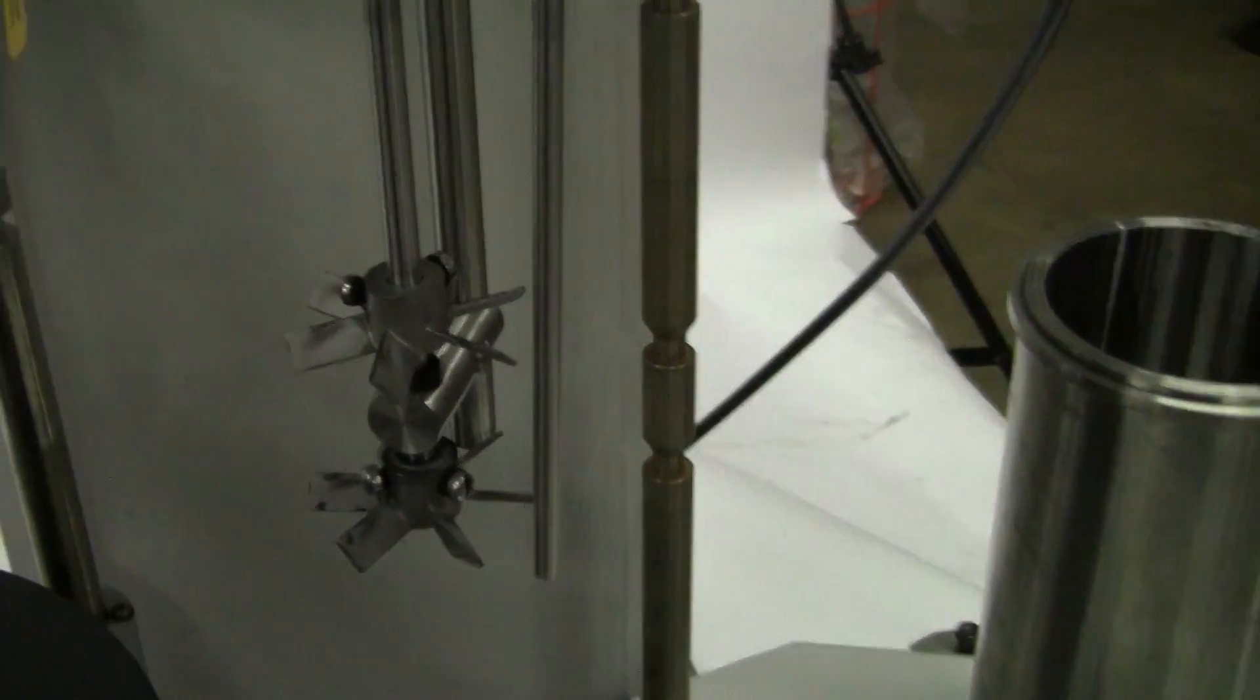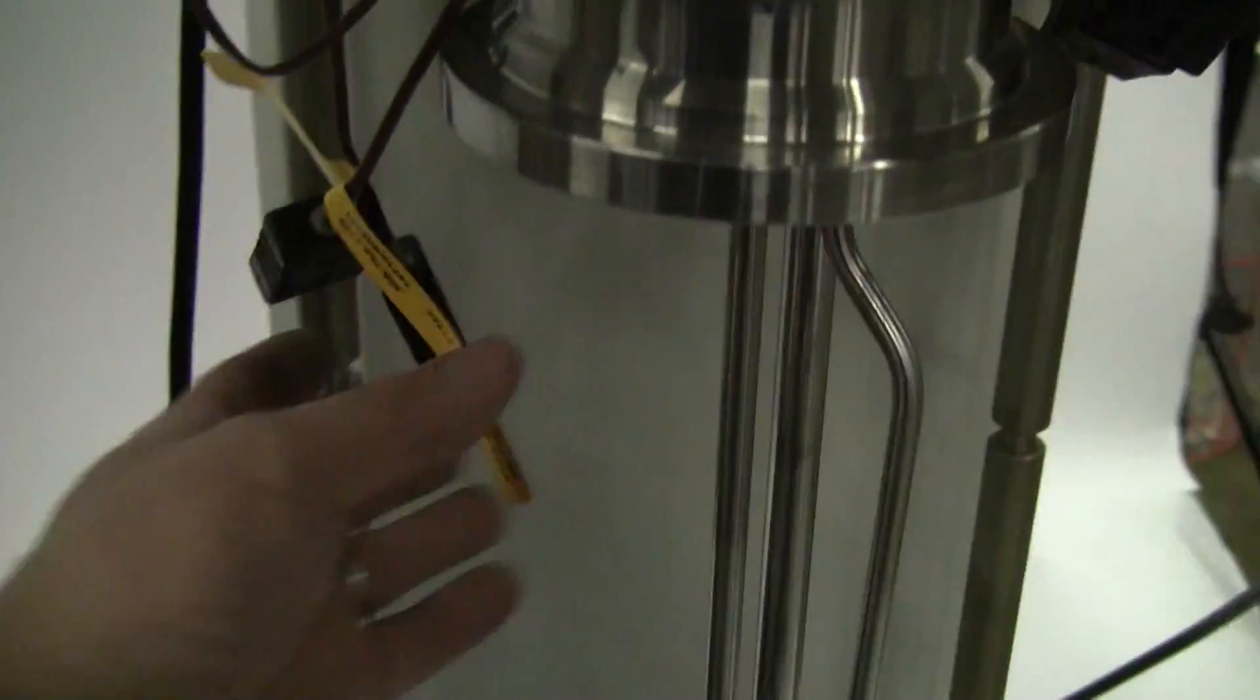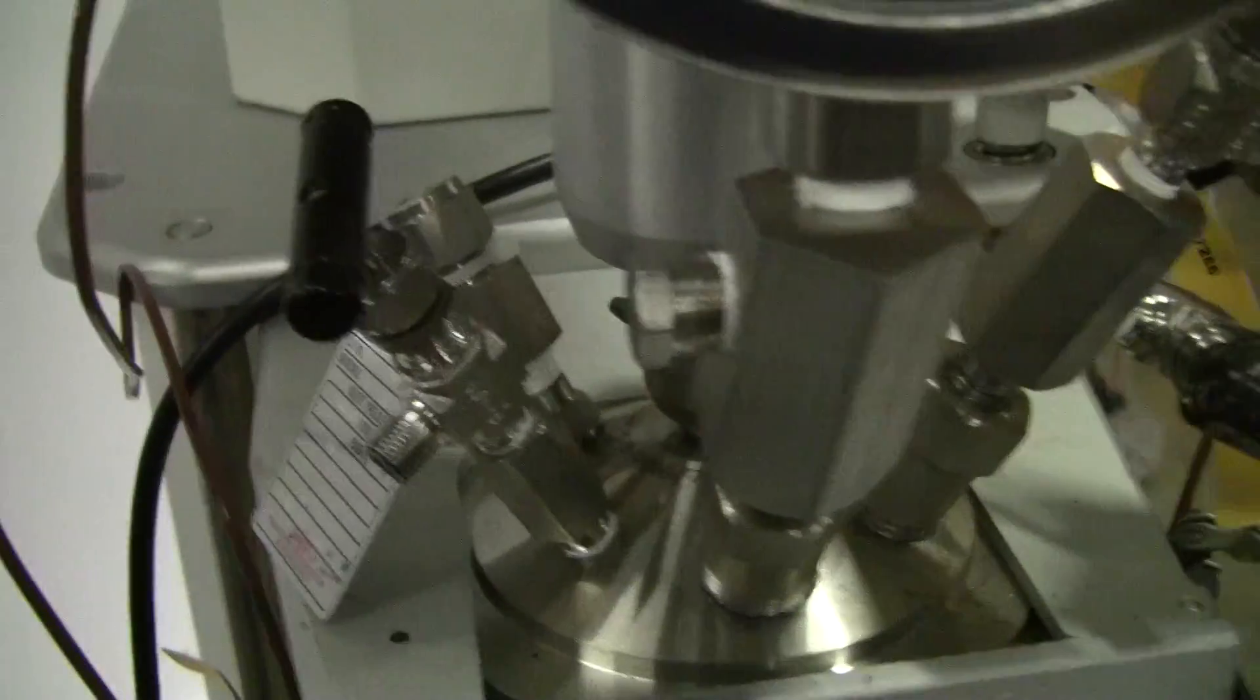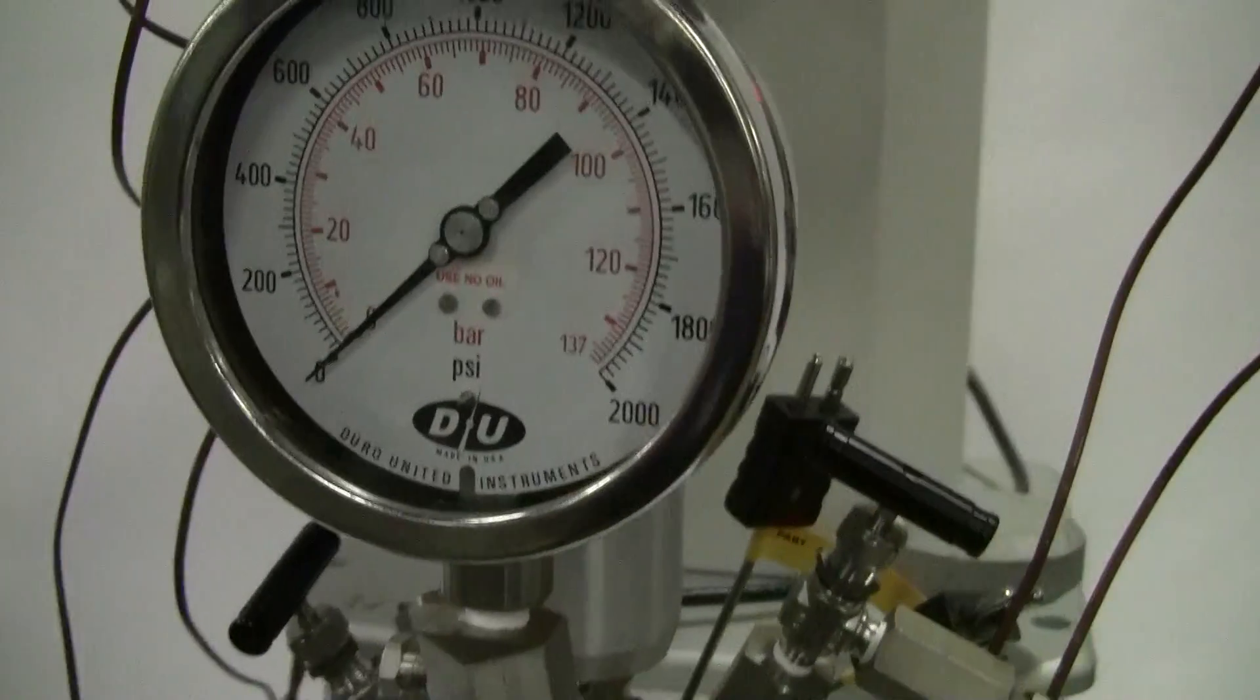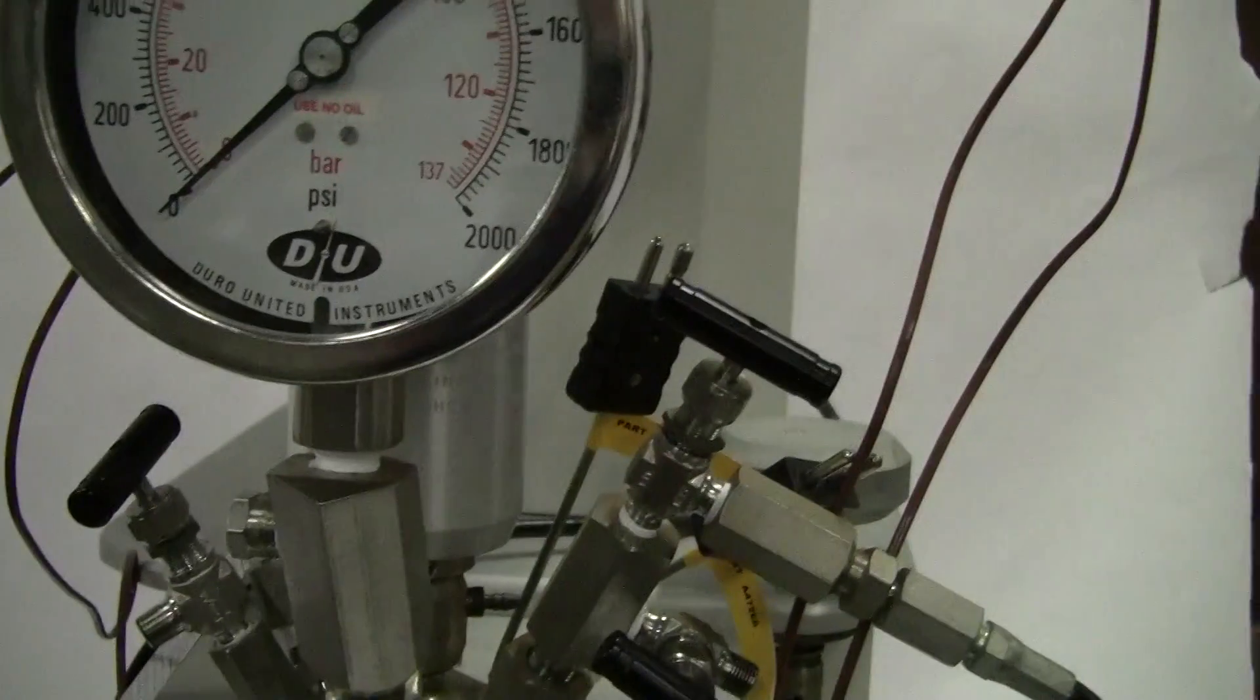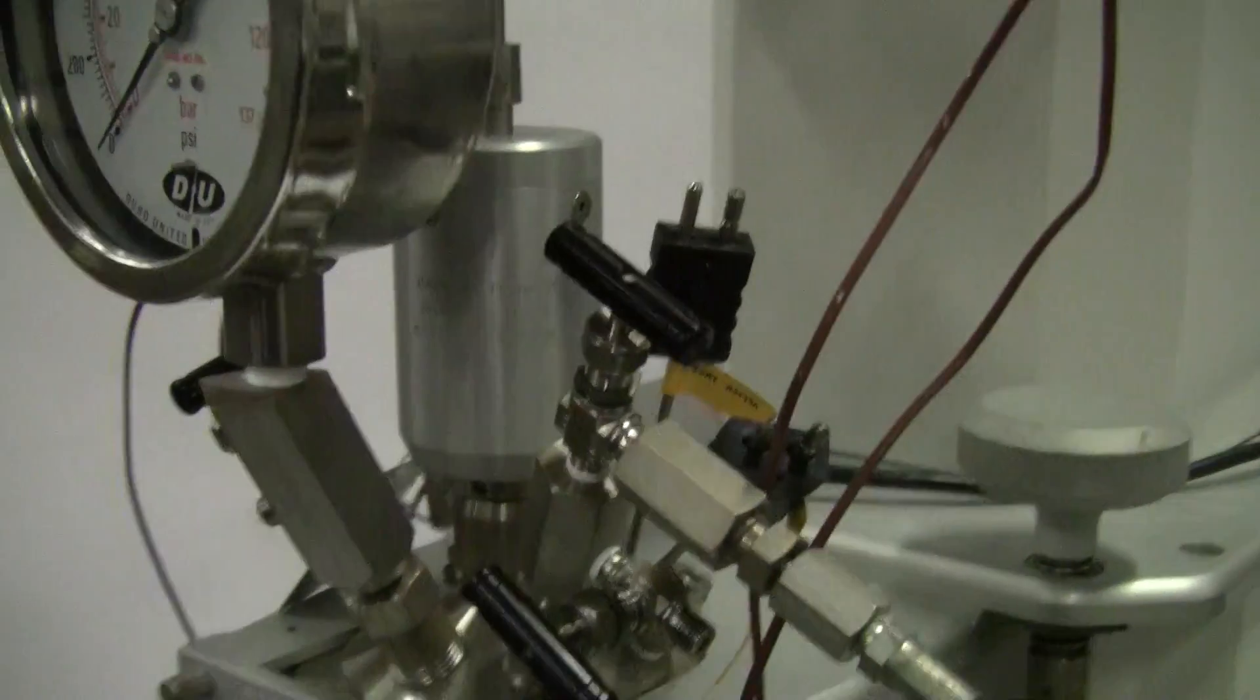Impeller blades, two thermocouples, here's the head. Pressure gauge rated at 2,000 psi.